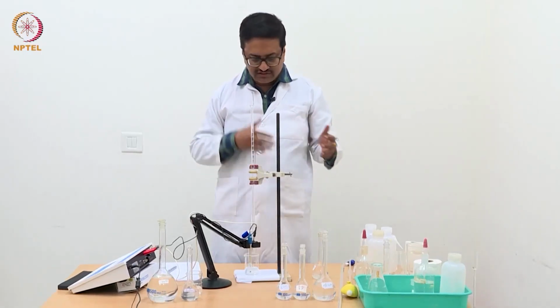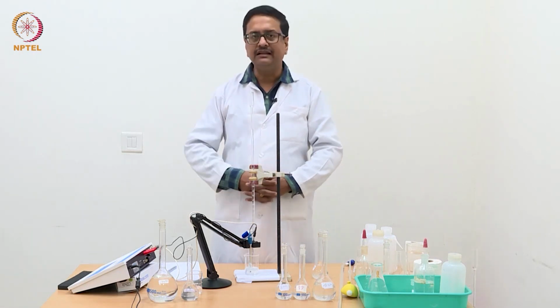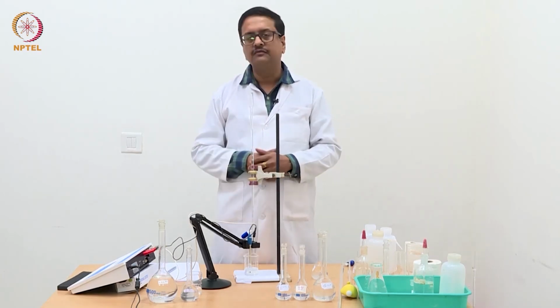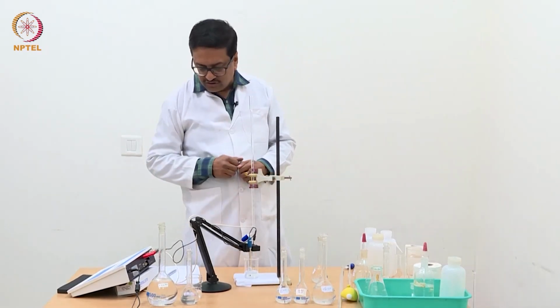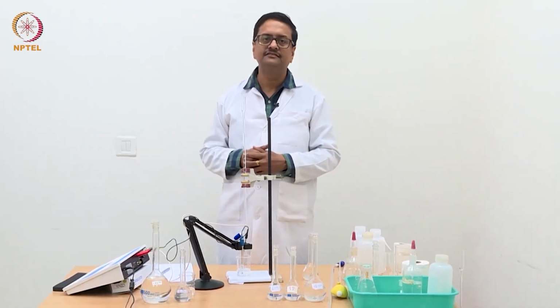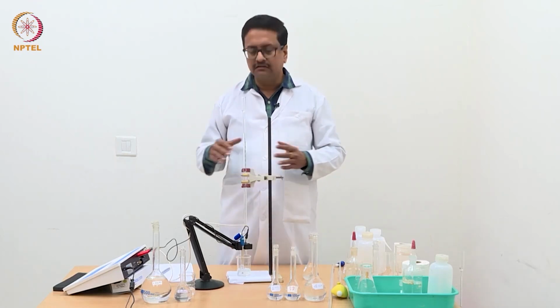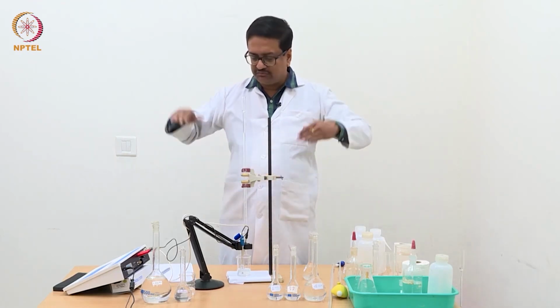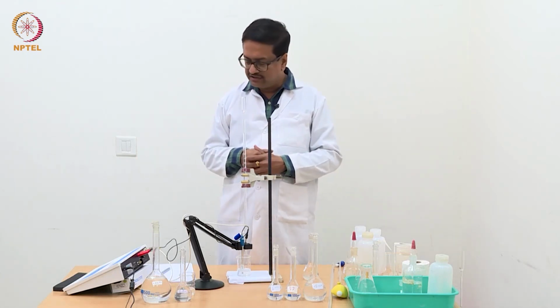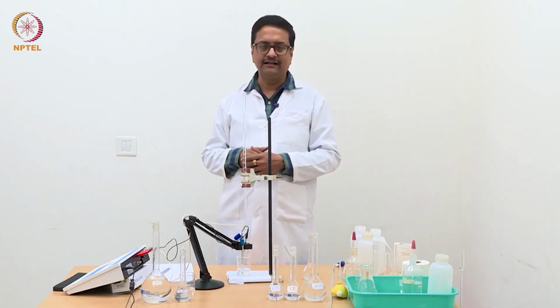Chloride ion is removed as a silver chloride precipitate and is replaced by nitrate ion, which has very similar conductivity compared to chloride, and hence we will not see any significant change in conductance till we get close to the end point. Beyond the end point, when we add more silver nitrate, we will see that the conductance increases significantly.